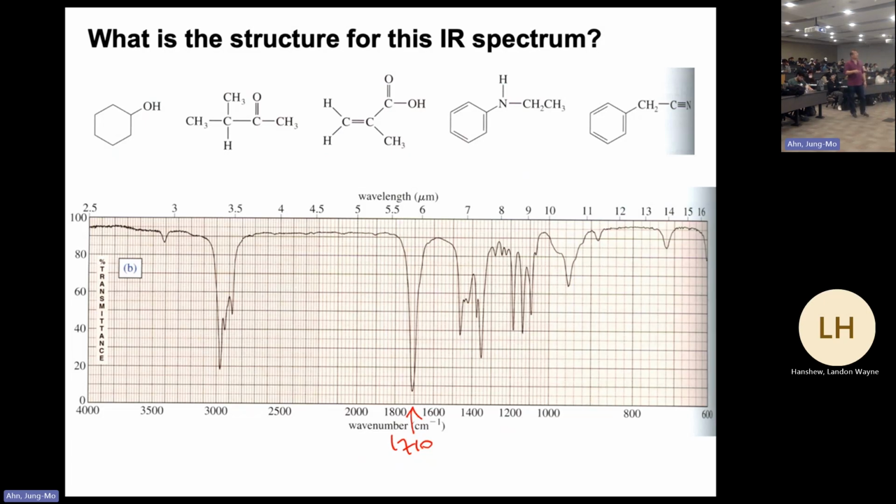This molecule doesn't even have any unsaturation. So if you look at the 3000 line, there's no unsaturated carbon-hydrogen band there at all, right? You've got nothing else showing up anywhere in the molecule or spectrum. The only thing you may be questioning is that small spike at 3400. Is it significant? That's the question you're going to ask, because it may be confused with this other molecule's signals.